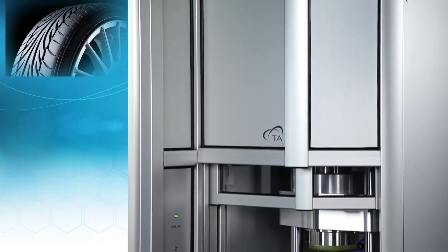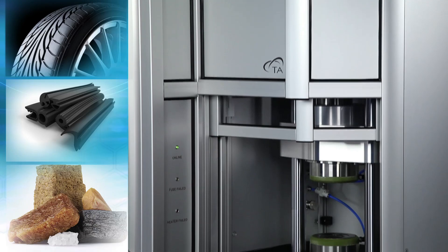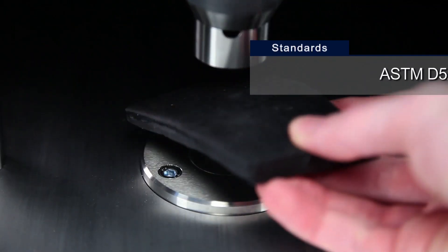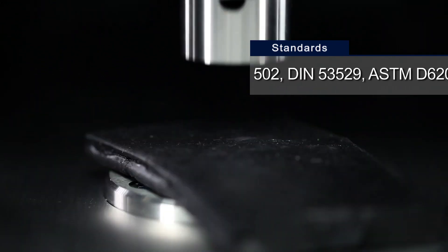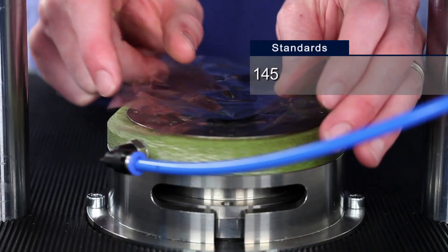Whether producing finished products, developing new materials, compounding, or producing natural or synthetic feedstock, the RPA Elite makes characterization of all rubbers, polymers, and elastomers simple and accurate.